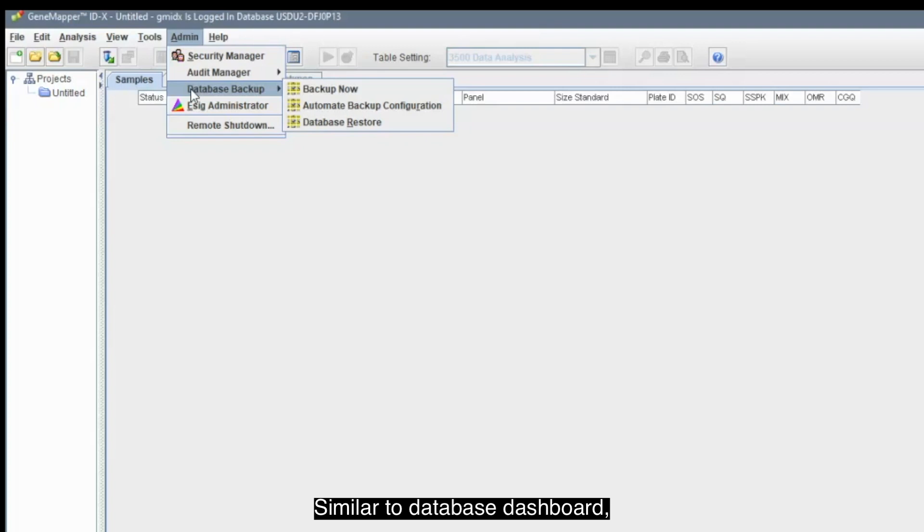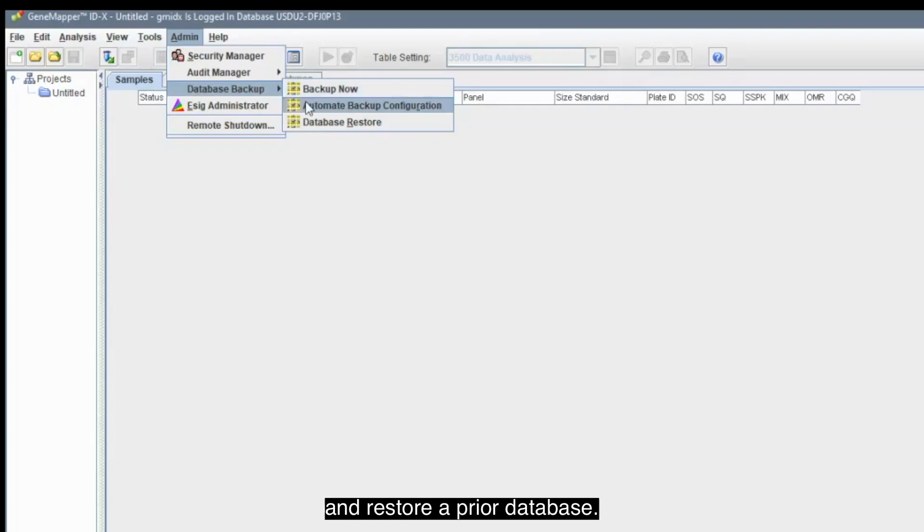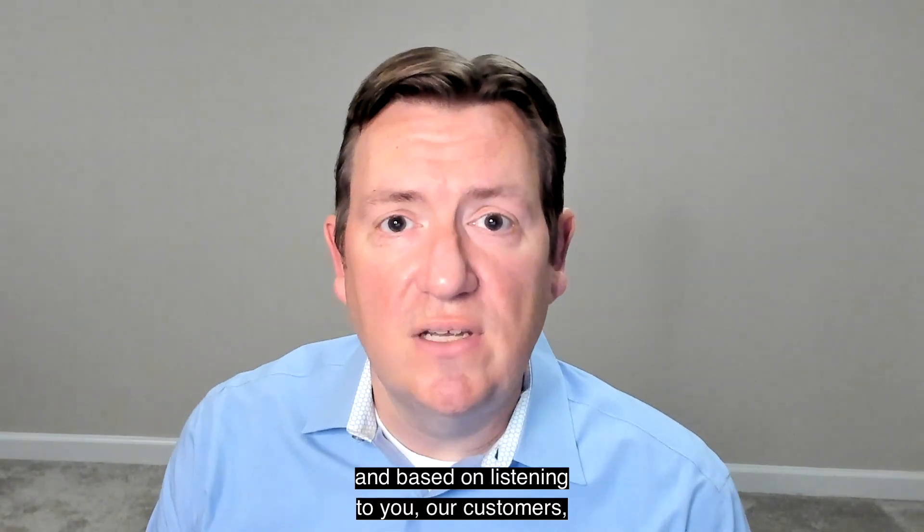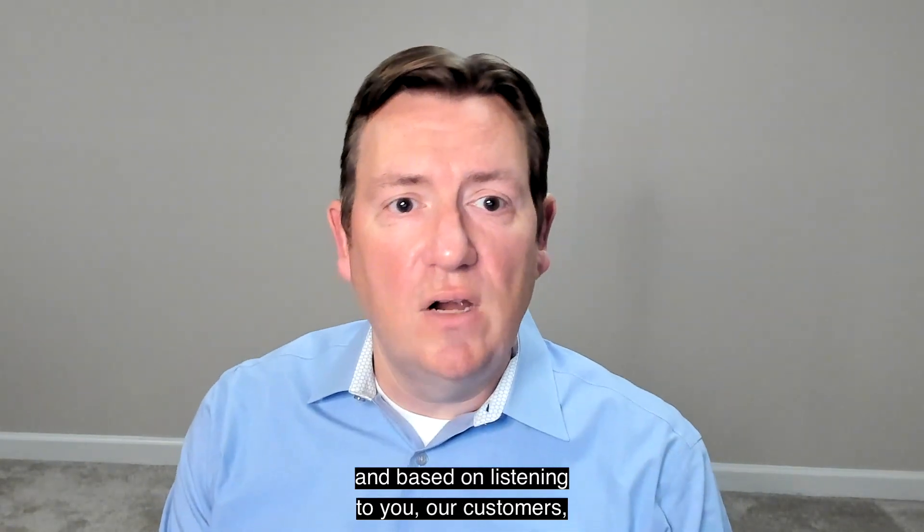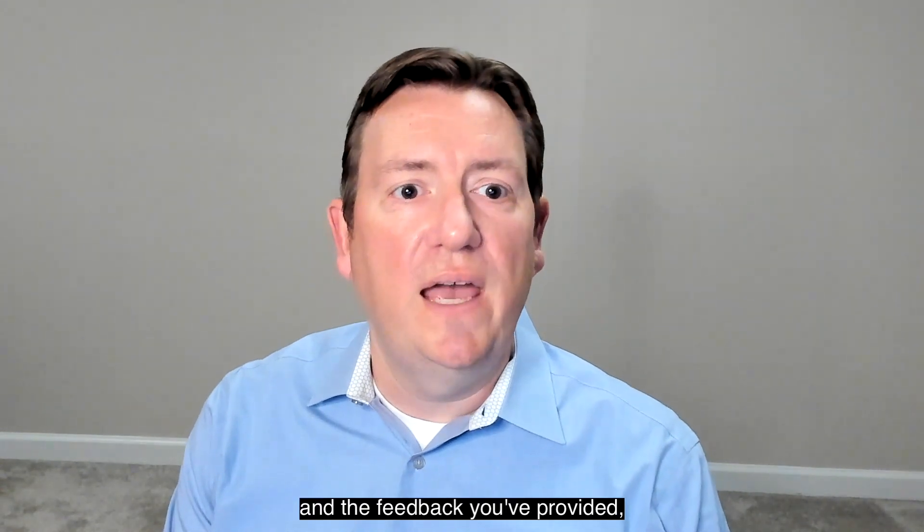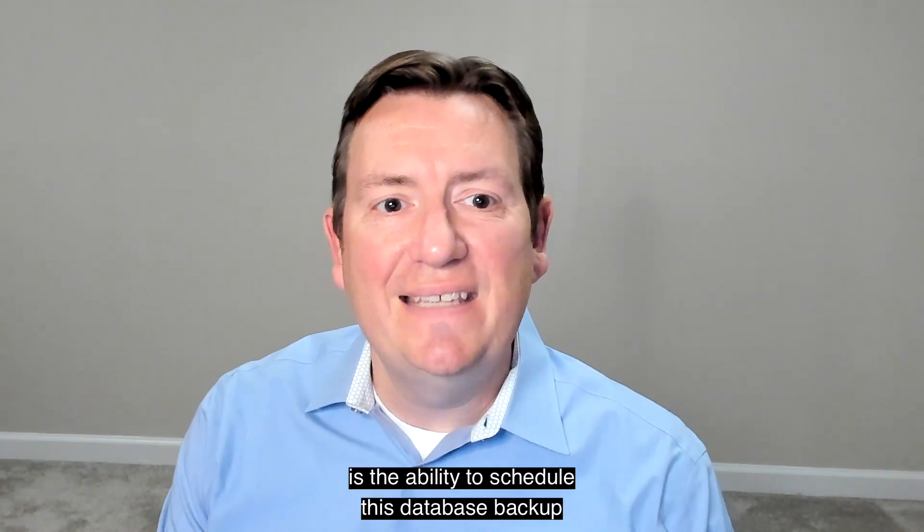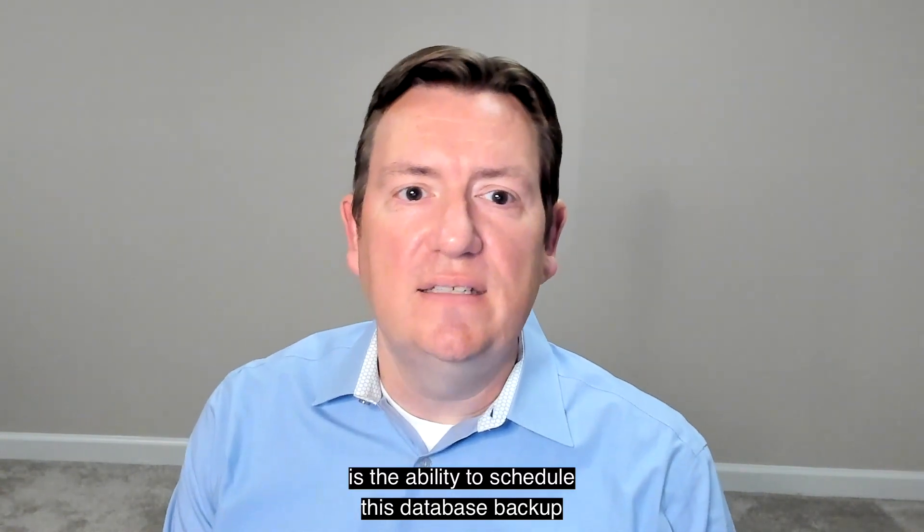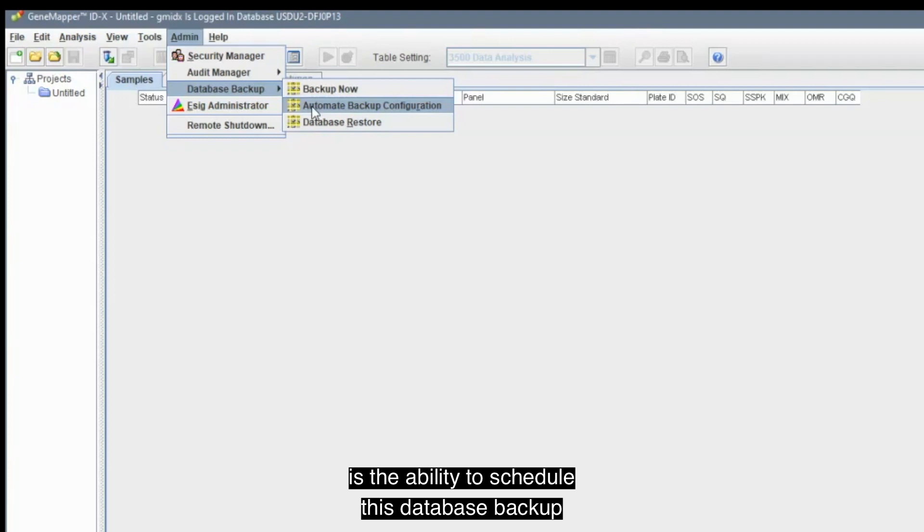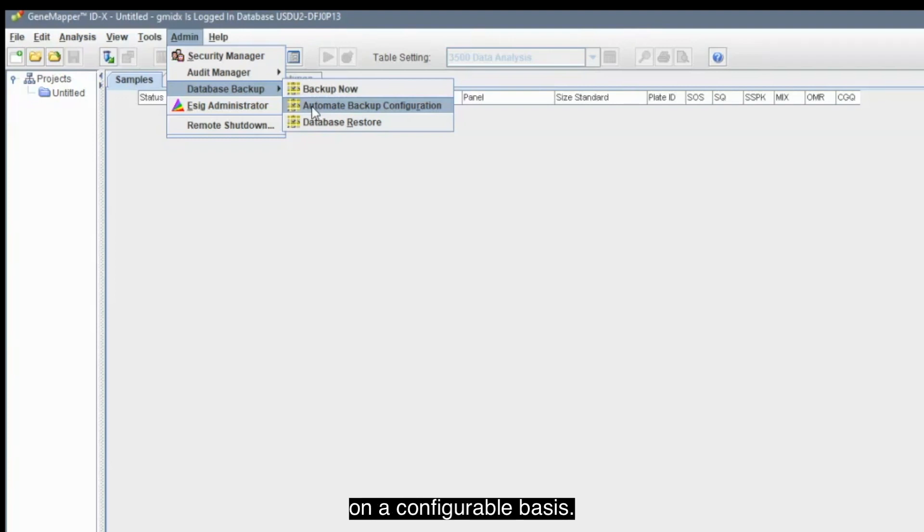Similar to Database Dashboard, you have the ability to backup now and restore a prior database. However, what is new, and based on listening to you, our customers, and the feedback you've provided, is the ability to schedule this database backup on a configurable basis.